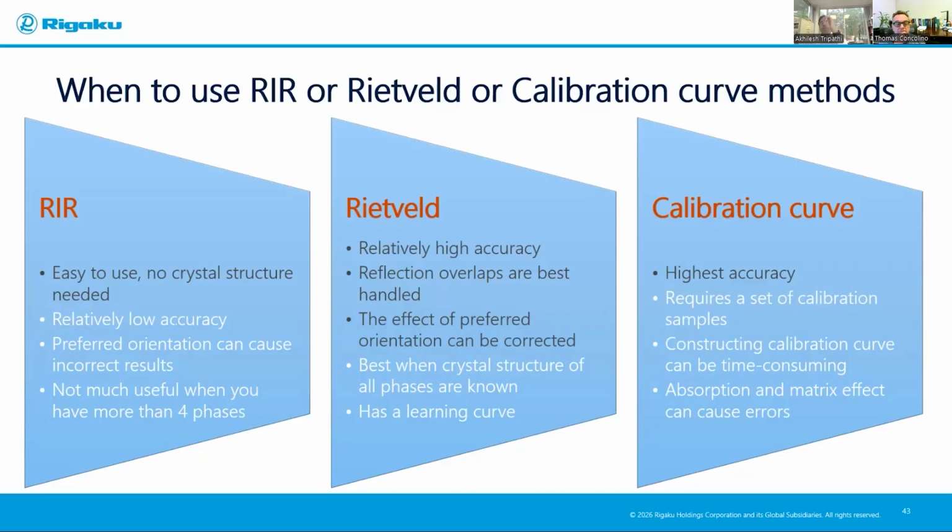So you create a calibration curve and you bring an unknown sample which has a preferred orientation on that peak, it's not going to work. Particle sizes are the same. Peak issues can be handled. Don't select a peak which has slight overlaps. Broadening has happened due to crystallite size. Background errors due to matrix being different.